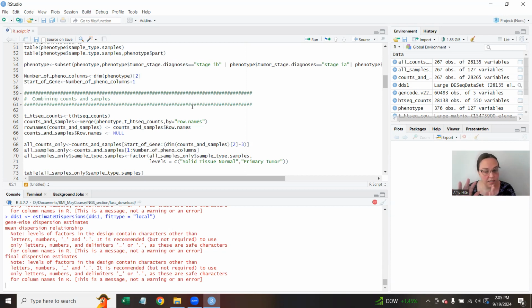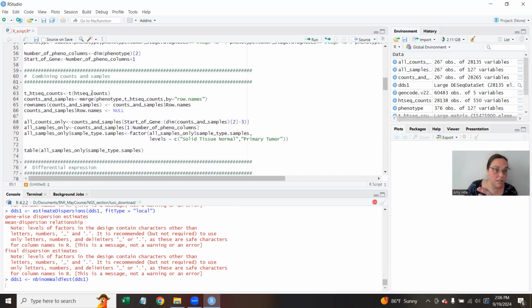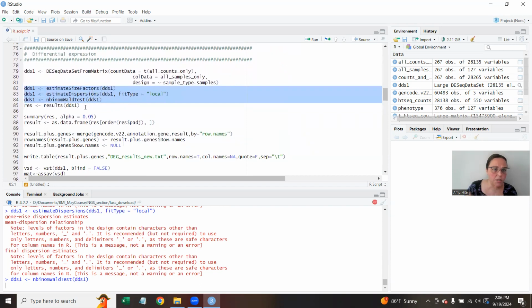Once we get into the Ohio supercomputer part of the class, you're going to have more computing power. There are options on the on-demand connection for the supercomputer where you can start a job of RStudio. It will run a particular R version. You can install your own packages. You can use data that's on OSC, and you can have a whole lot of computing power, as much memory as they have. And with that, you could run these commands a lot faster.